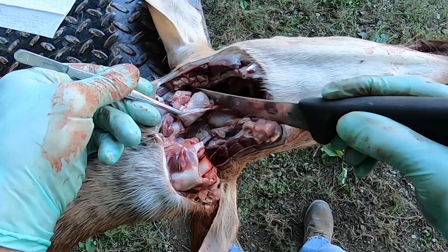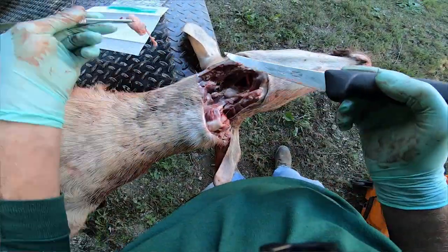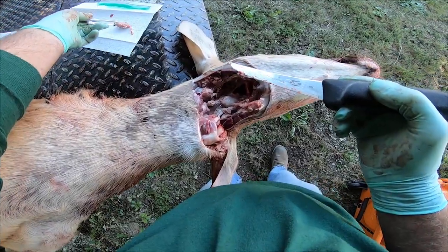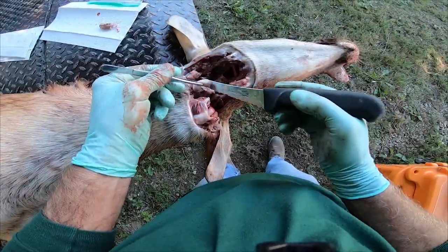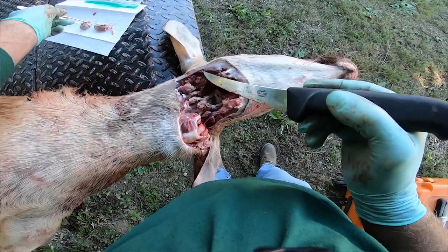While grasping a node with a pair of pliers or forceps, gently cut it from the remaining tissue to remove it from the head. Repeat this process on the other node. If you cut into or through the lymph nodes when removing them, it will not interfere with diagnostic testing.